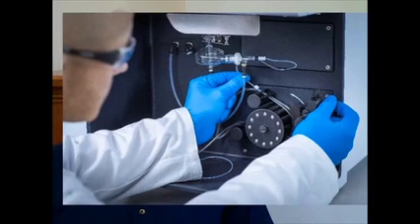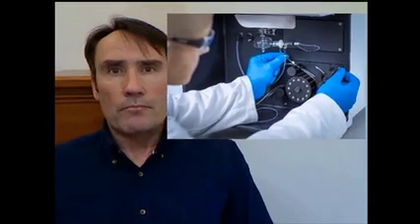Let's have a look at the sample introduction system. First thing to note is the sample has to be in solution form to be analysed by an ICP-OES. That doesn't mean you can't analyse solids, but you have to get those solids into solution form first.